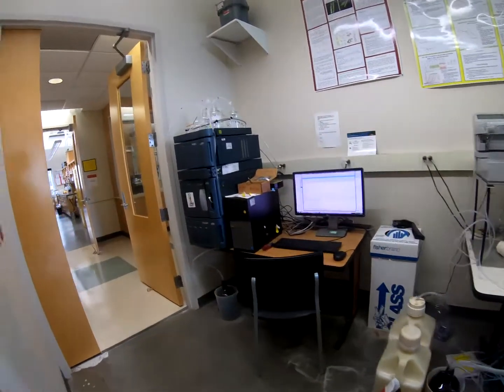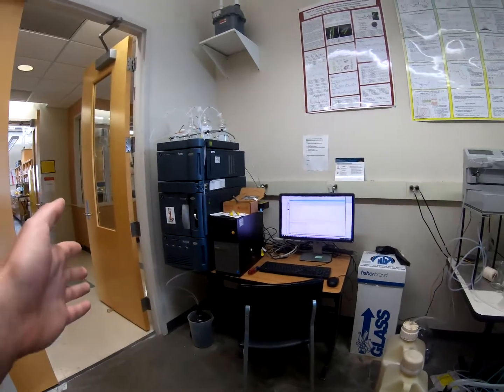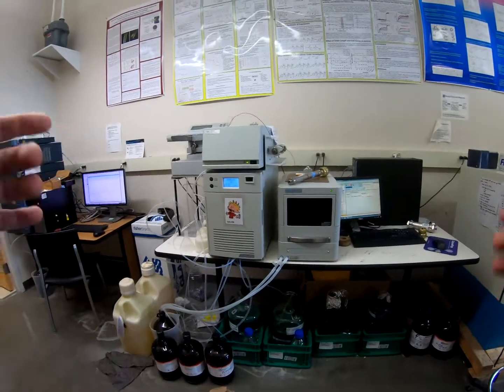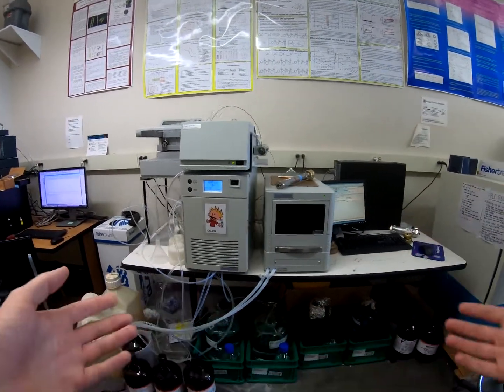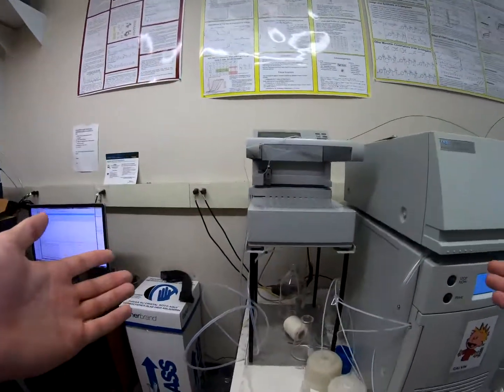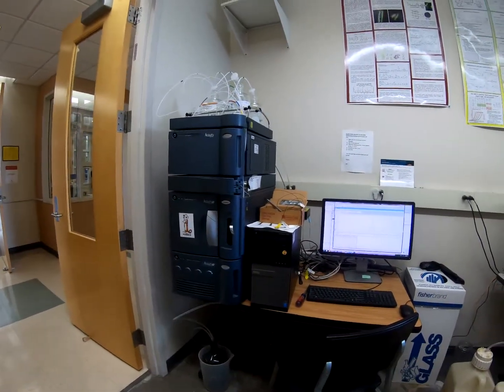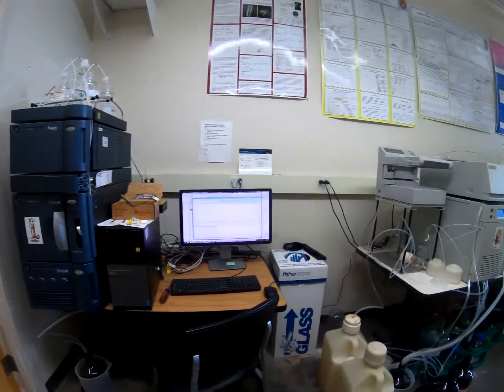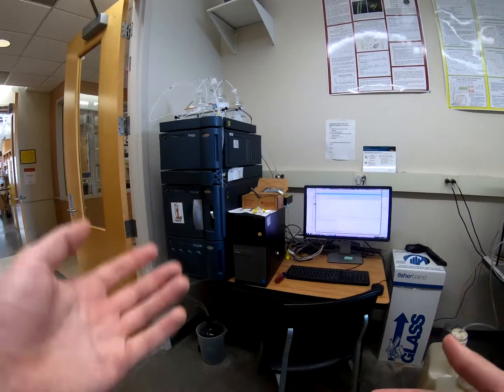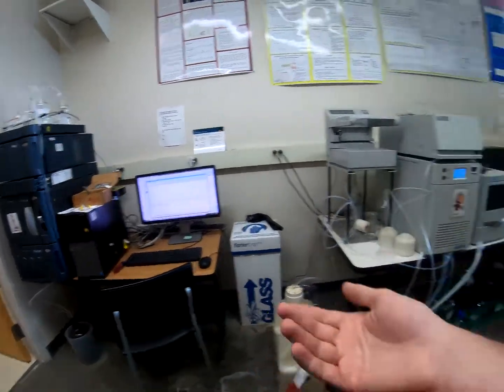So as soon as you walk in on the left door of Lab B, you have two machines facing you on the left. So you've got Hobbs, our UPLC, and Calvin, our HPLC. Calvin is more of our workhorse, just like Big Red, doing the actual separations and purifying of the compounds and peptides that we're working with, and collects them neatly in these test tube racks up here. The UPLC does more quantitative breakdown of what you have. So you do all your work on your HPLC, and there may be an artifact or just not as high resolution as the UPLC. So you do a quantitative purity check on Hobbs.